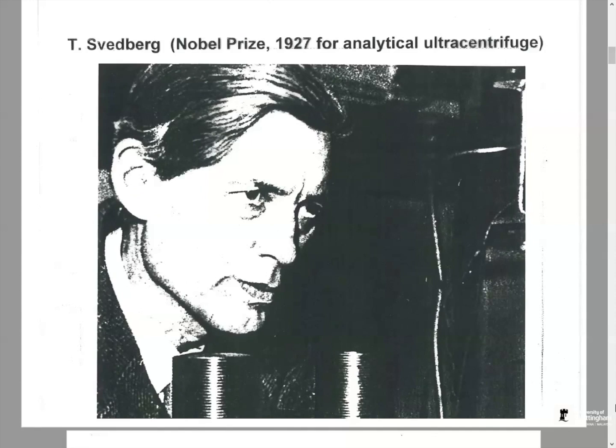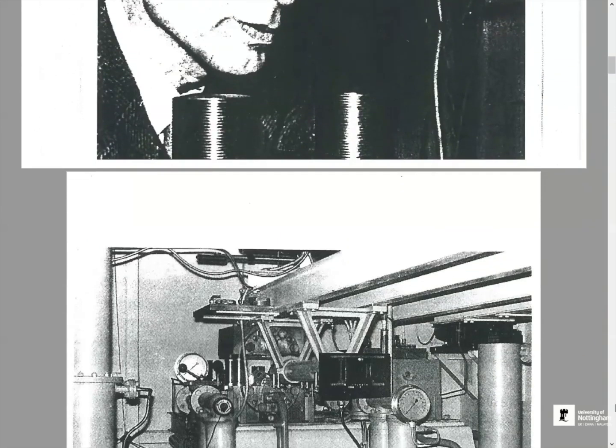It was using this method that proved once and for all that proteins were discrete molecular entities, large molecules, rather than another theory about them, that they were just a colloidal mass, really, without any real form. So it was the ultracentrifuge, invented by Svedberg in the 1920s, which sorted that out, and which is why he got his Nobel Prize.